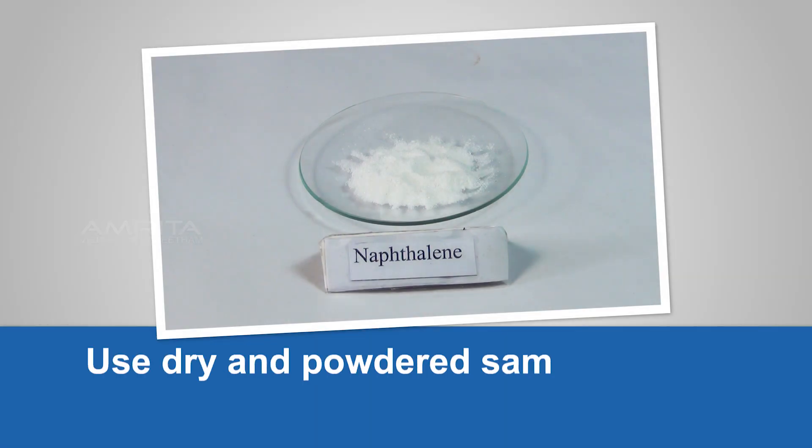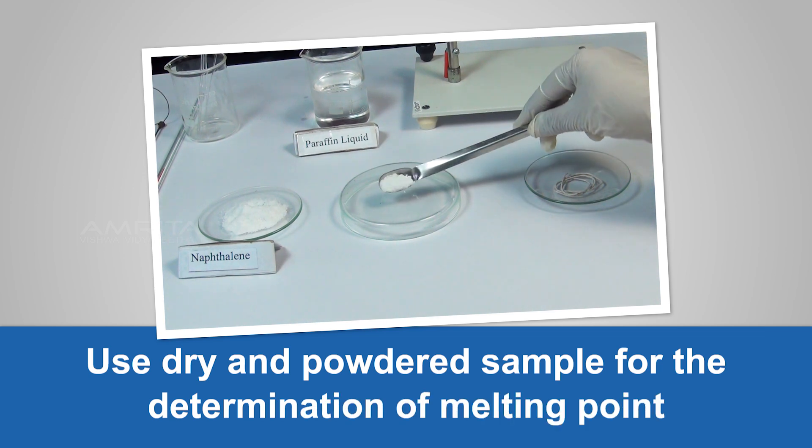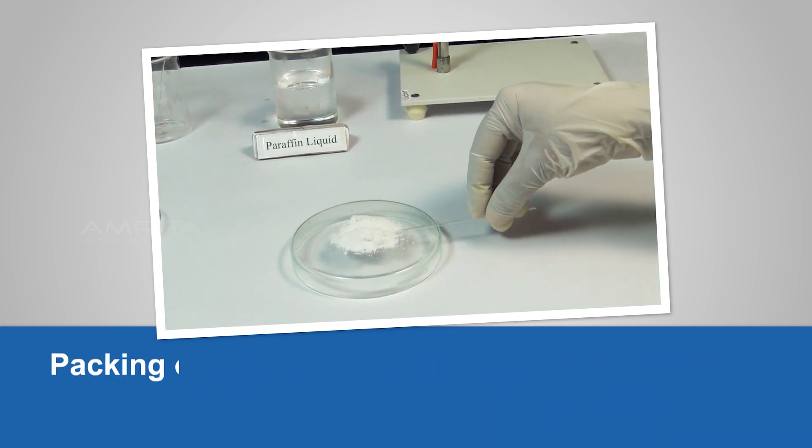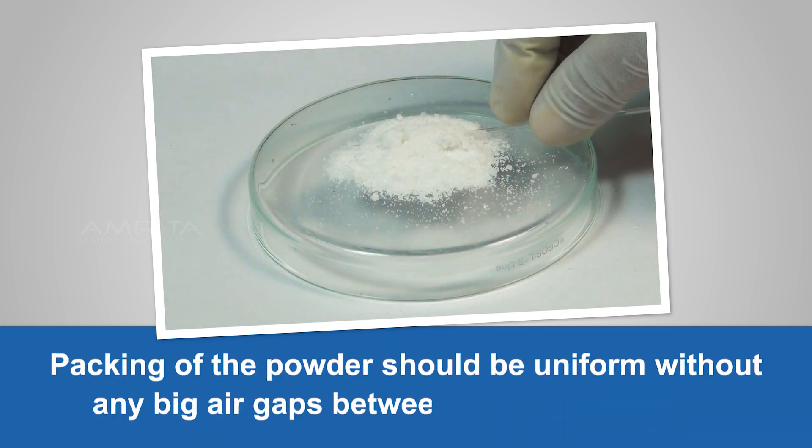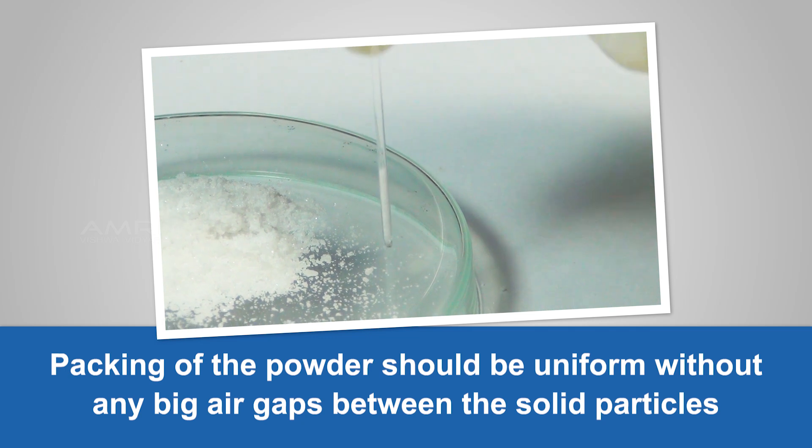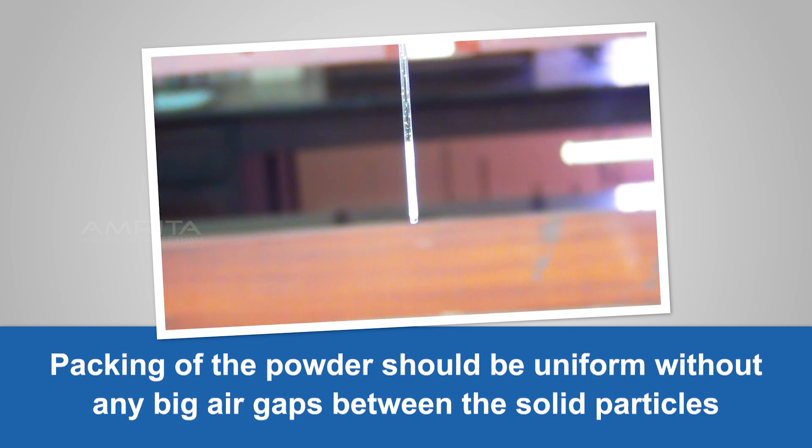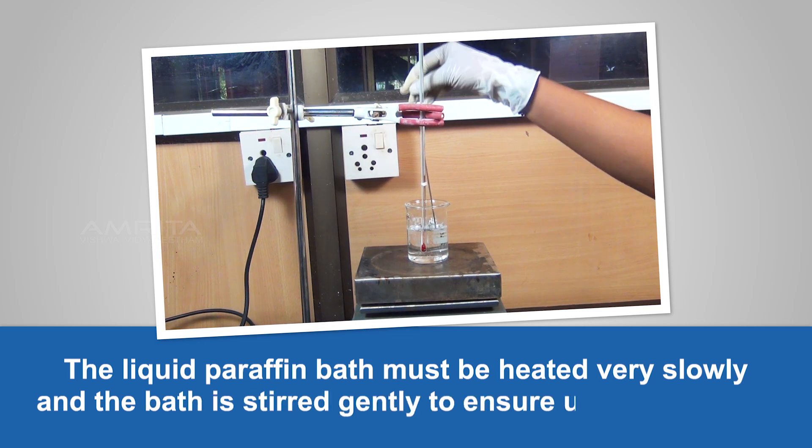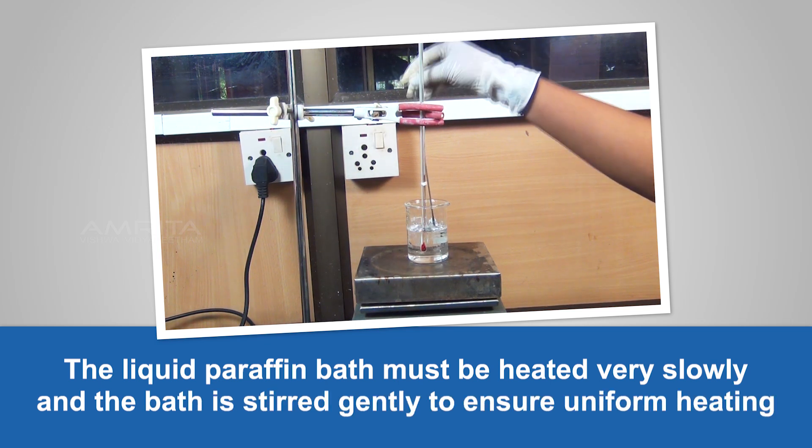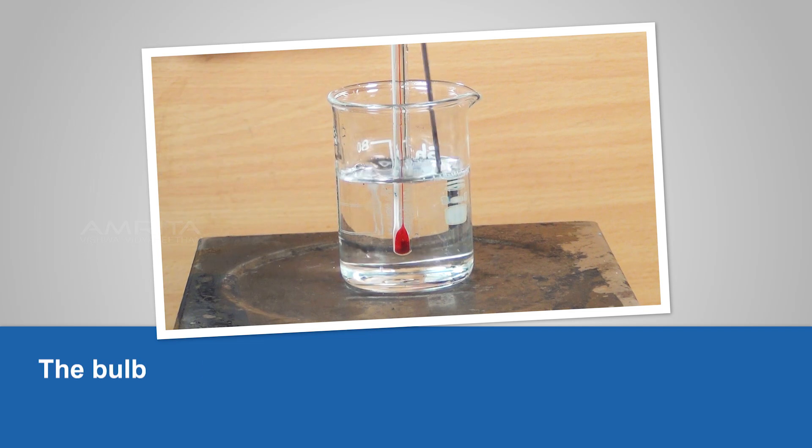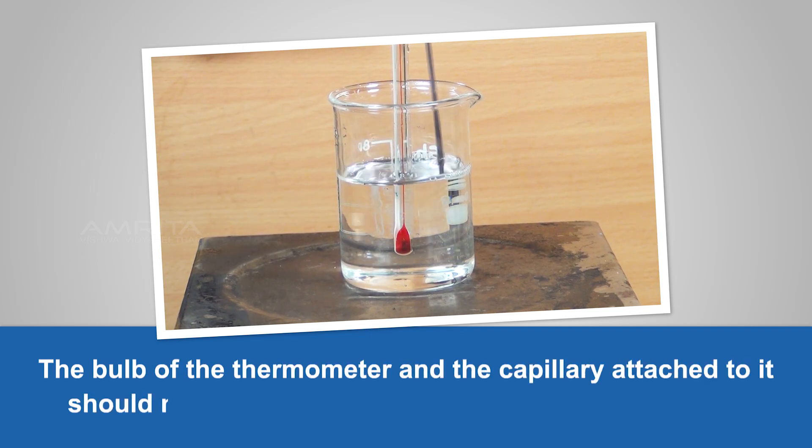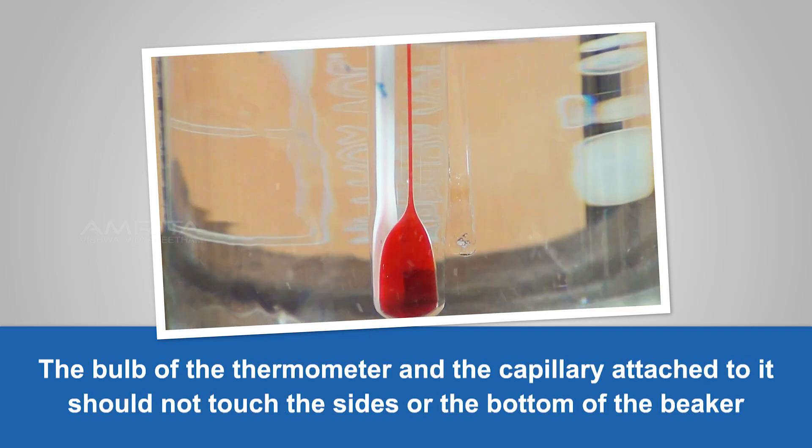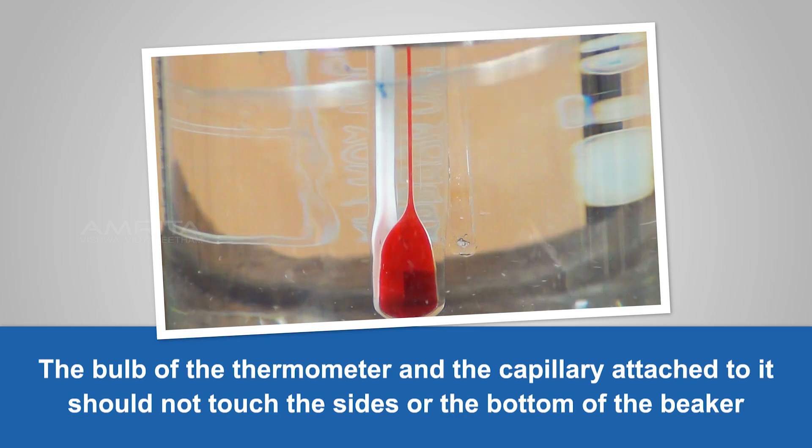Precautions: Use dry and powdered sample for the determination of melting point. Packing of the powder should be uniform without any big air gaps between the solid particles. The liquid paraffin bath must be heated very slowly and the bath is stirred gently to ensure uniform heating. The bulb of the thermometer and the capillary attached to it should not touch the sides or the bottom of the beaker.